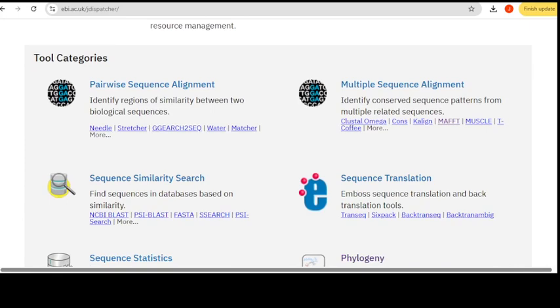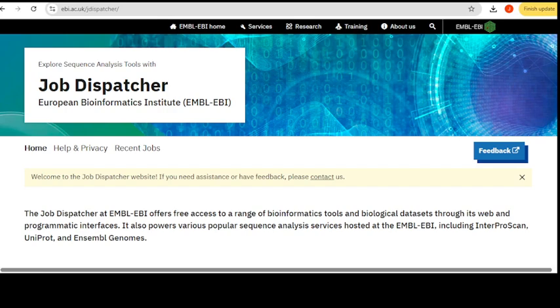And here is what we want to use. I said we use MAFFT. There are other ones: MUSCLE, T-Coffee, Kalign, Clustal Omega. But whatever you want to use, I am comfortable using MAFFT. You can either call it MAFT or you can call it MAFFT.